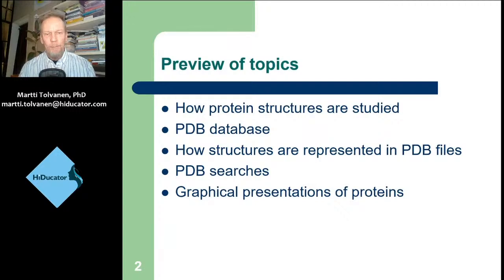Then we'll look a little bit inside of PDB files to see what it is like as text. That will help you understand how it's rendered into graphics, and also will give you an idea how to select things when you see how things are called within the file. These same things will be usable in molecular graphics.